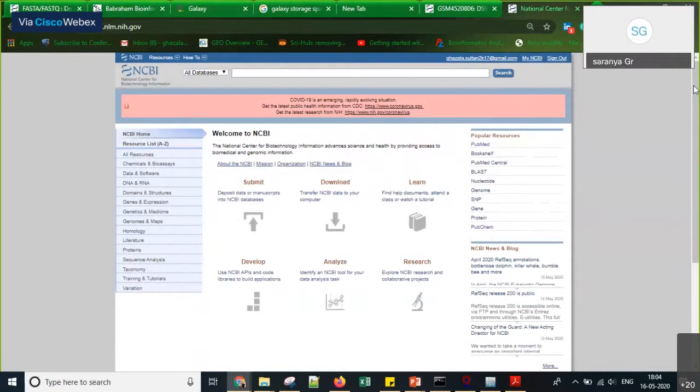For me, actually, we processed healthy samples. We are working on gut microbiome. We have been given abundance and the average DNA base pair length, so we are confused about what can be done further. CSV file format means comma separated values, right?